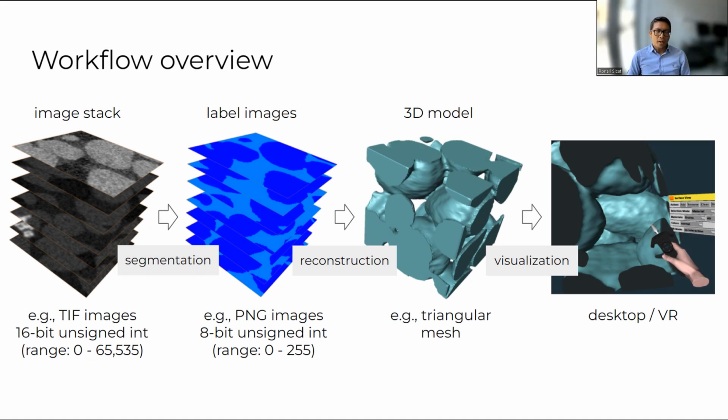Yeah, so that was the first part of our workshop today, which is the overview plus Avizo basics. So hopefully by now you have a general idea of what the whole workflow is. So later on, as I said, we'll go and dive deeper into each of the steps. And yeah, if there's any questions, you can post them on the chat.